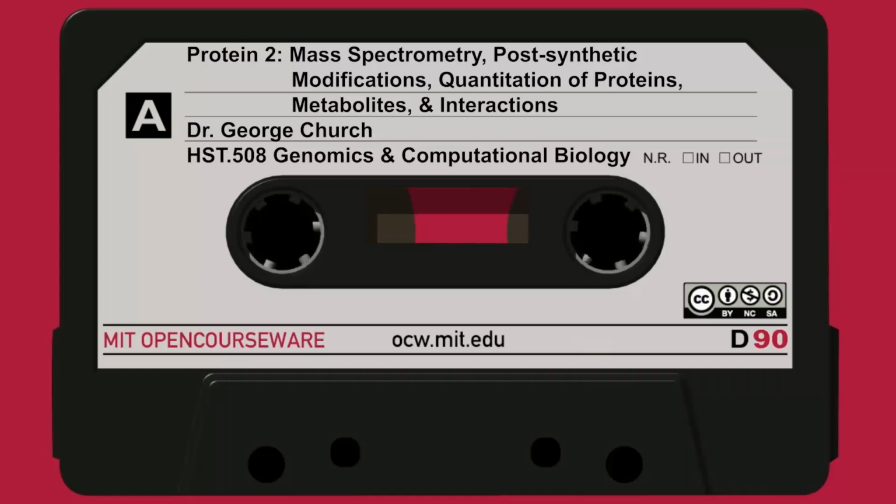And so what we'll find is mainly a spectrum from the very slowest to be eluted. They require the most organic, and hence the longest retention time would be the highly hydrophobic aromatics, tryptophan and phenylalanine. Each has a component which you obtain by linear regression of each of these peptides. You know the sequence of these peptides, you calculate their composition vector, and then you relate it to the retention time that's observed. So the lower plot is the observed ones, and after you do the regression, you get a set of these coefficients.